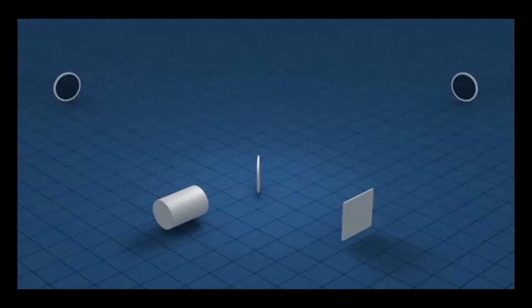The following video shows a simple animation of the Michelson interferometer.